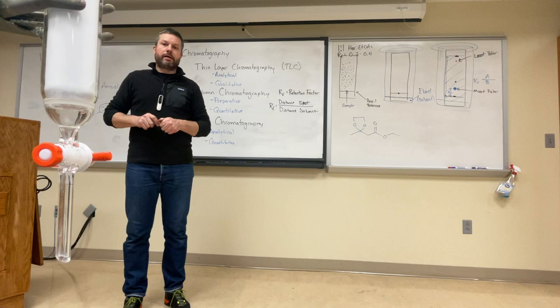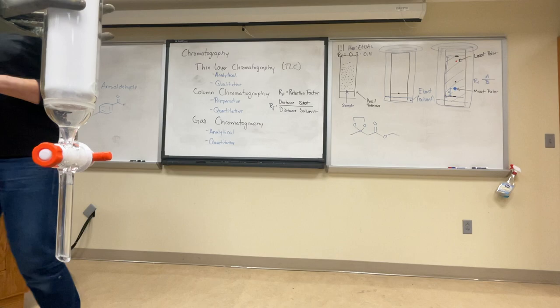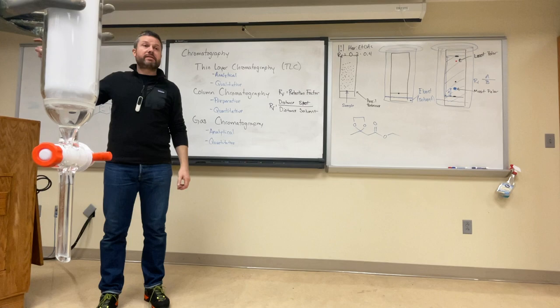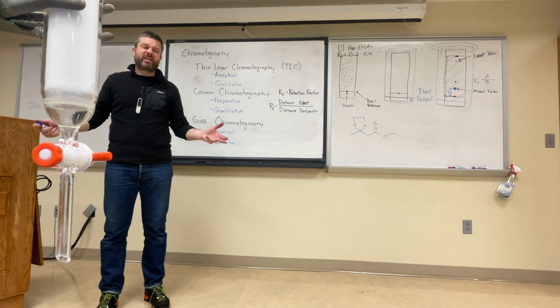So are we just doing the TLC today and then doing the columns over the next 2 weeks? Correct, yeah. You're just doing TLC analysis today. After TLC analysis, we're all gonna come back here and I'll show you how to set up a column, how to set it up, run it, collect fractions. It'll take like 5 or 10 minutes.